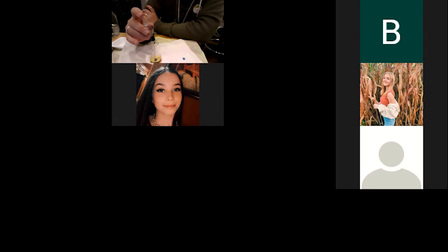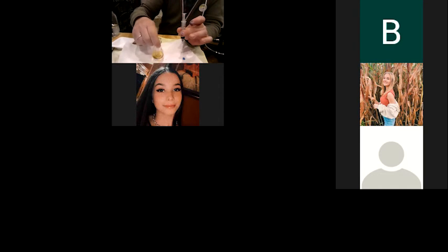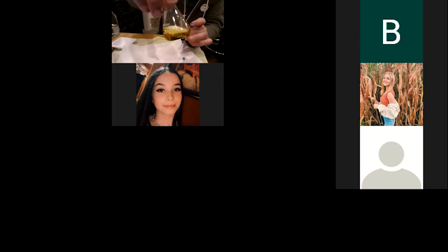There's probably only going to be just a couple more drops now. Oh man, yeah, this color is probably just 1 or 2 more drops. We should be there.